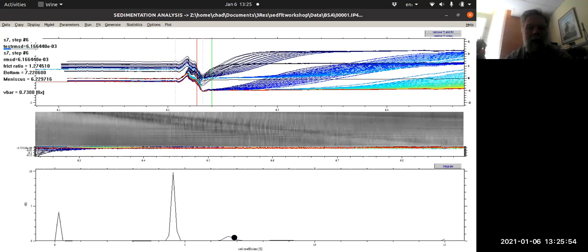And part of that has to do with the fact that the way things sediment isn't exactly the same based on how they dimerize. I'm not sure I could explain that better, but generally speaking, in terms of sed coefficient or C of S distributions, your dimer will be about 70% of what you expect it to be from the multiplicity of the monomer's sedimentation coefficient, if that makes sense. Does anyone have any questions on this so far?